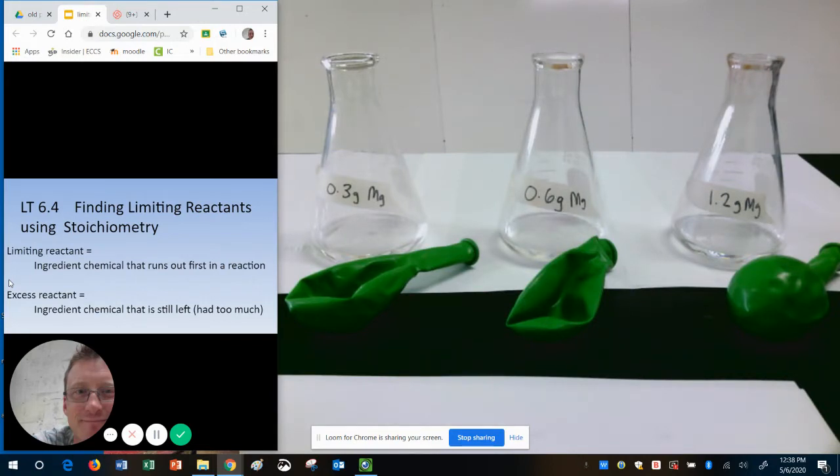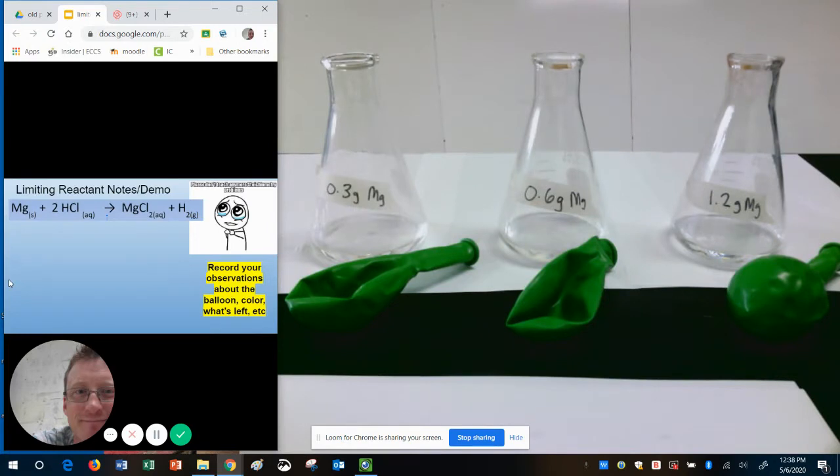So today the reaction that we're going to do is the reaction of magnesium metal with hydrochloric acid, that's HCl. And when it reacts it produces a salt, magnesium chloride, which stays dissolved in liquid, and it produces hydrogen gas.